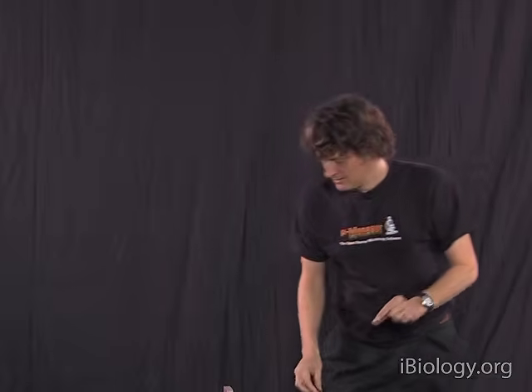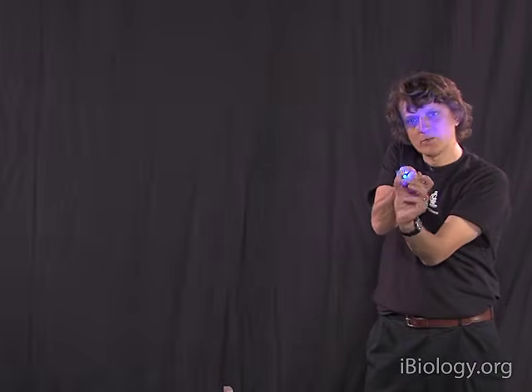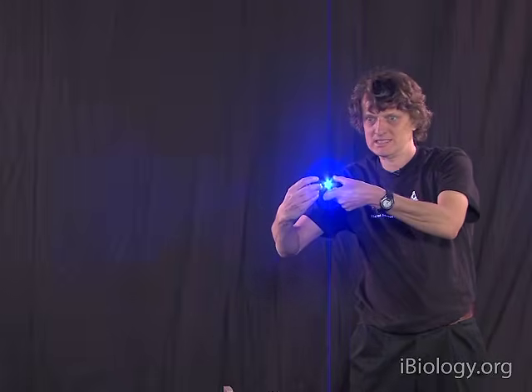Then, the next part is this dichroic mirror. So this one is designed, again, such that it reflects blue light, so you will now not see anything coming through, but if I reflect it to you, you may be able to see that.